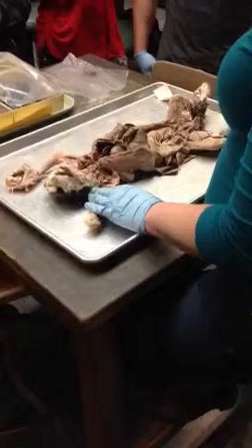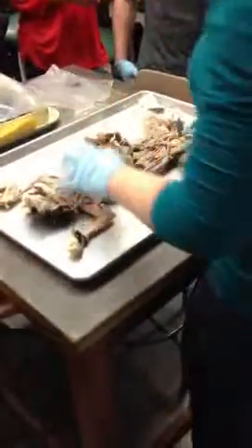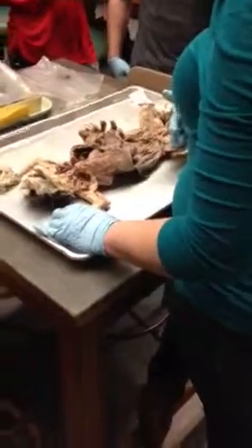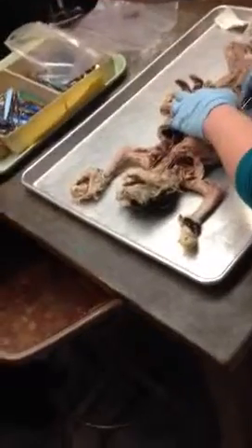Some things to keep an eye out for. Okay? Moving on to the urinary system. Okay? The kidneys are retroperitoneal. They are anchored to the posterior wall of the abdominal cavity. Okay? They're going to be anchored by a lot of fat. Okay? So what you're going to need to do is clear away some of the fat, but be careful.